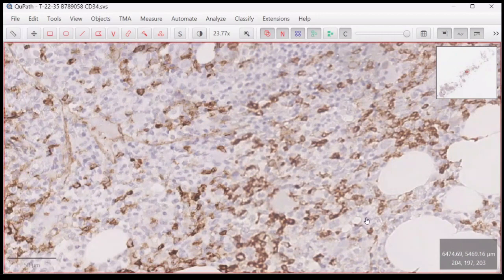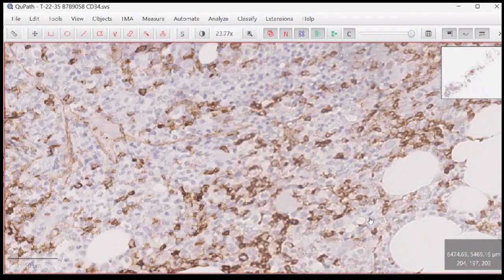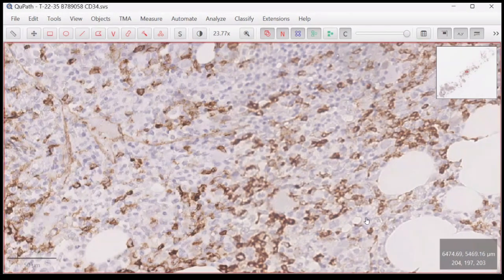This cluster formation with plentiful CD34 expression already confirms that this is the acute phase. This cluster pattern, I just quote what Prof. Barabarbin mentioned, is very useful to indicate that the patient is either not in remission or in early relapse.